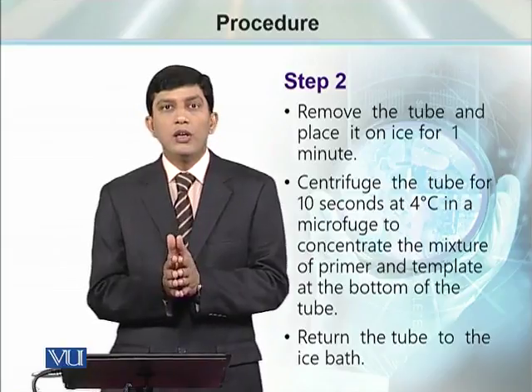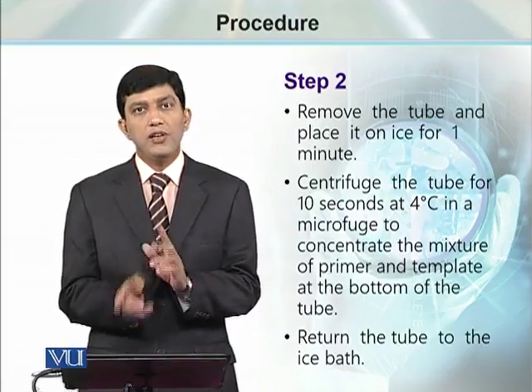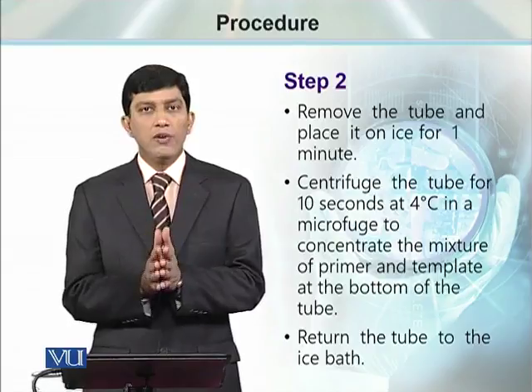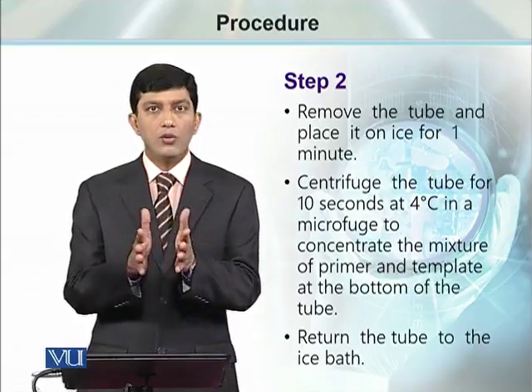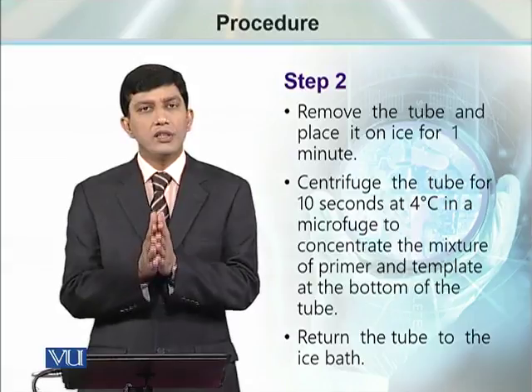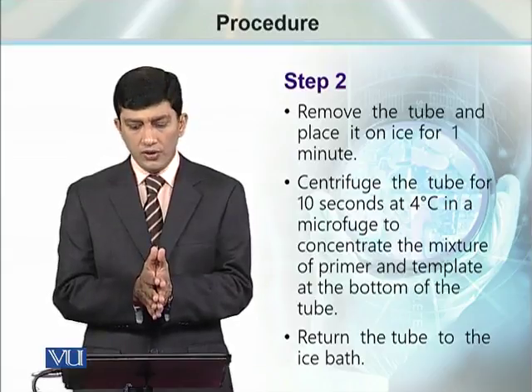this tube immediately to ice and we keep it there for 1 minute. So this shift in temperature from boiling temperature to the ice will not allow the 2 strands of the DNA to re-anneal or to renature. Instead, the primers present in the tube are going to bind to the template strand at their complementary positions.